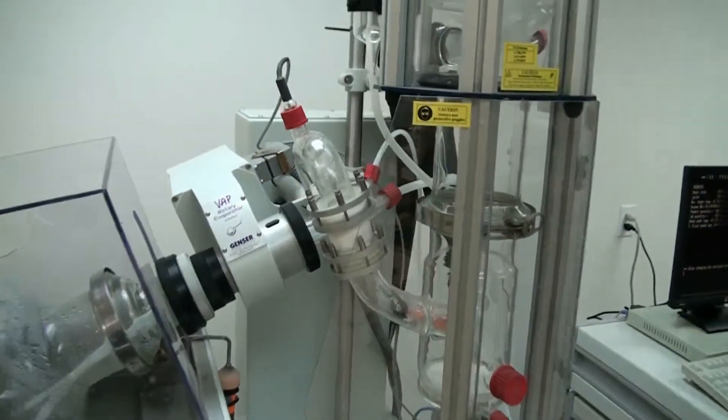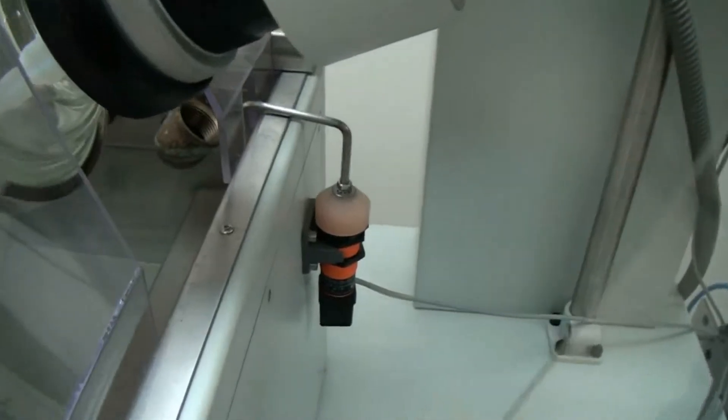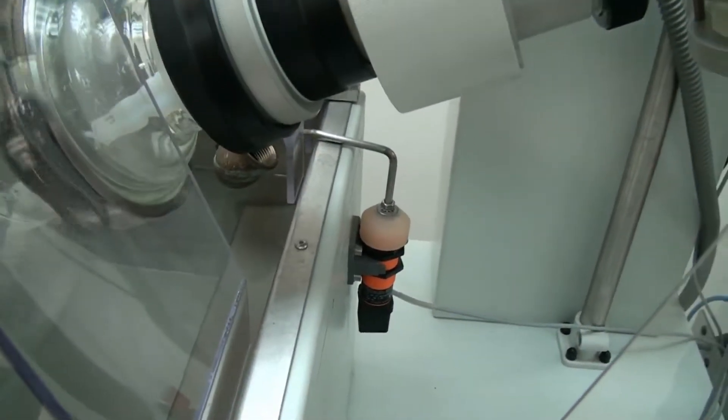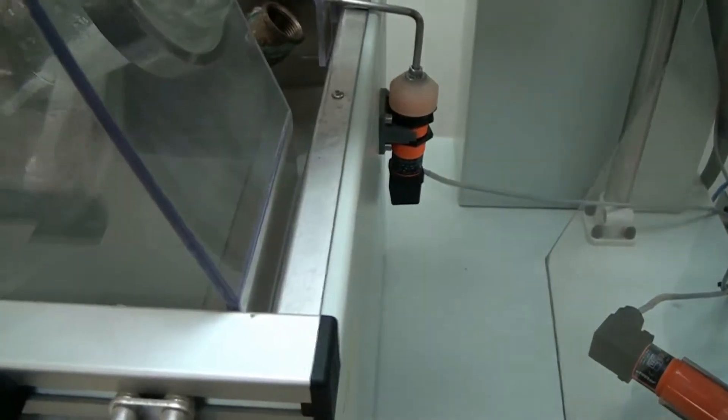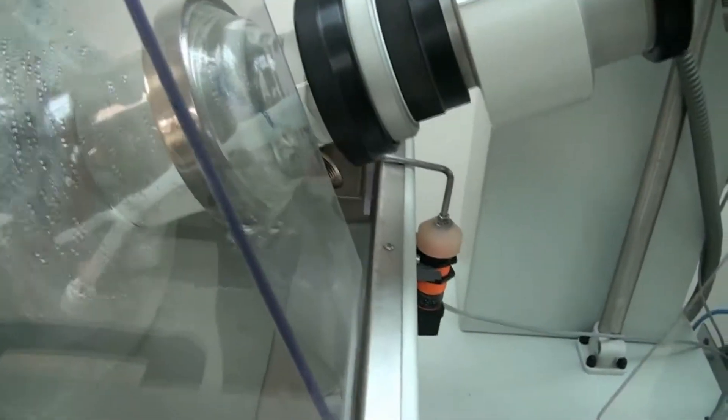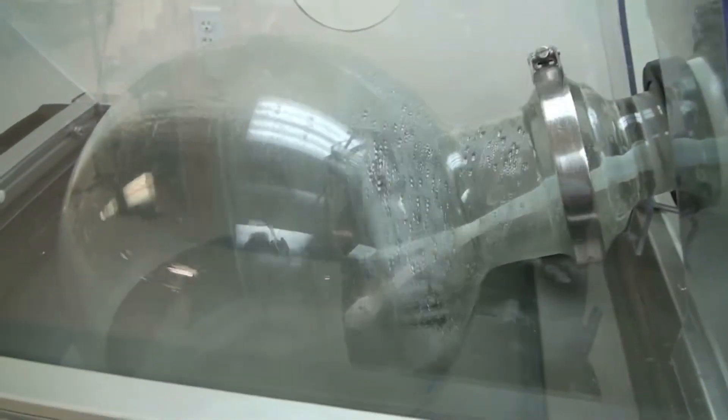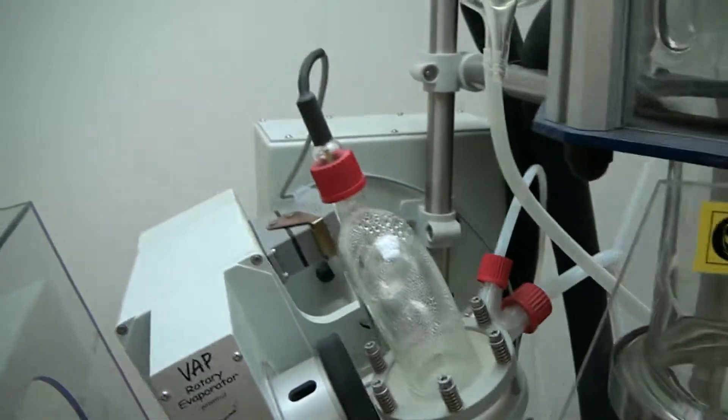I want to mention the bath here. It has a sensor right there that's just monitoring the level of the water in the bath. If the bath were to get a little low and need more water it would actually open the valve and automatically fill it back up to the desired level. That way you always maintain the level in your bath because it's very important to maintain that with the flask being measured off the arm back here in the control panel.